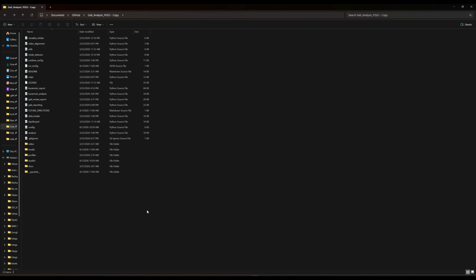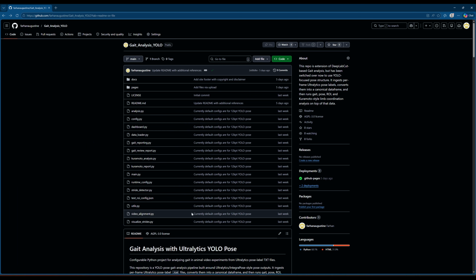I personally did not know that Kuramoto models were so powerful and were being used in robotics and gait analysis, human clinical studies, and those type of things. But I was quite inspired by some of the talks that I heard at the APS March meeting last year and this year. So I was like, let me try this out. I have to try this out for myself, and you know what? It's quite interesting what you can learn about the brain from just watching mice walk.